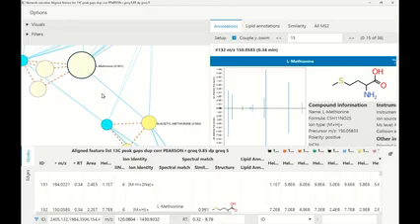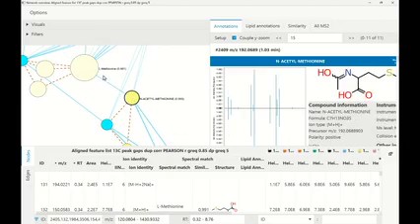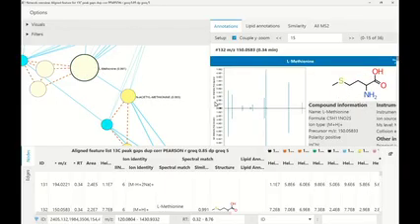And also you should be quite careful with the annotations that we give you. We only give you what the submitter in MoNA actually says. And if you then also verify the retention time, or verify it with other orthogonal dimensions, then of course you might be able to say if it's L or D. Otherwise, you should be a bit more careful there. But so now we have L-methionine and then N-acetyl-methionine.